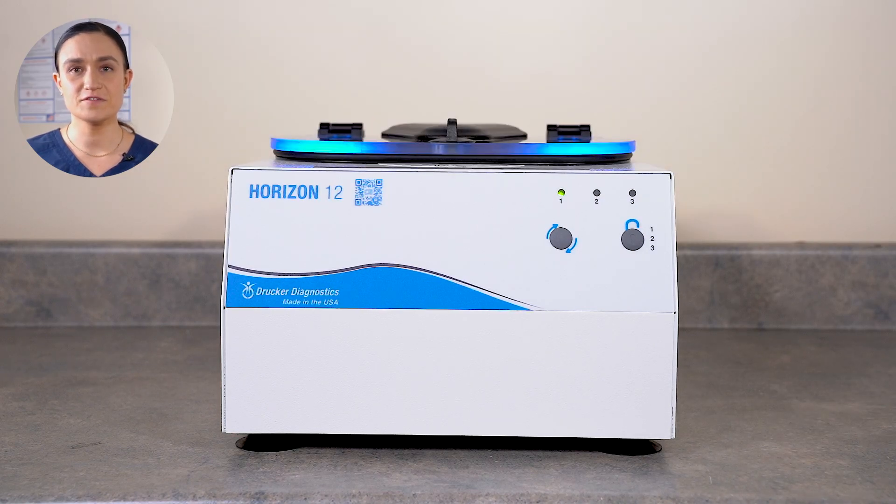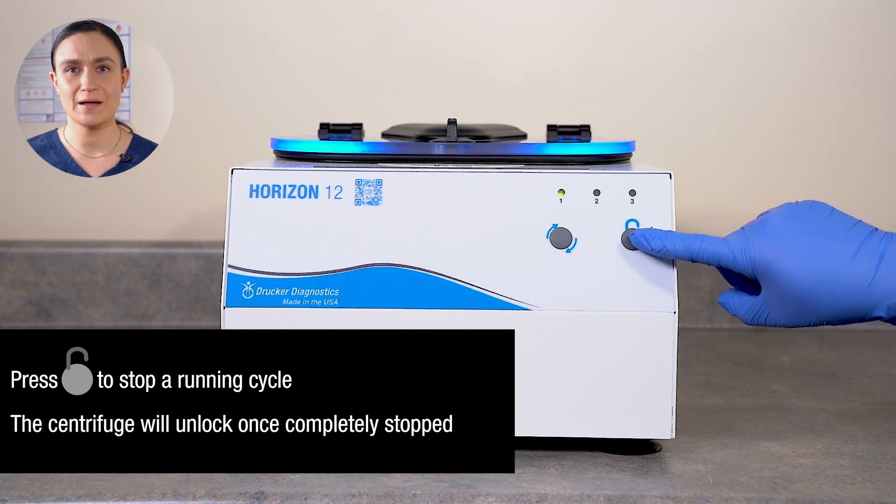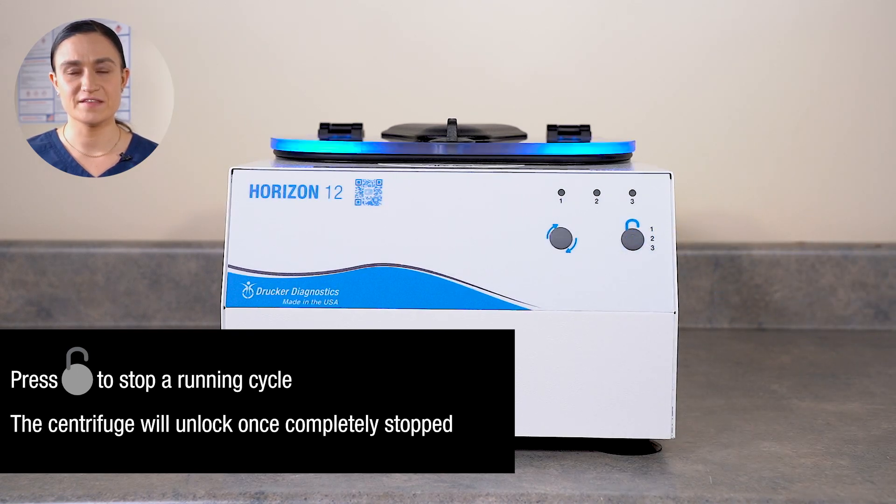If the centrifuge is spinning, pressing stop/unlock will stop the current cycle. The centrifuge will come to a stop and then unlock automatically. You won't need to press stop/unlock again. The centrifuge will automatically unlock after every spin, so if you open it during that time to retrieve your samples, there will be no need to use the stop/unlock button.